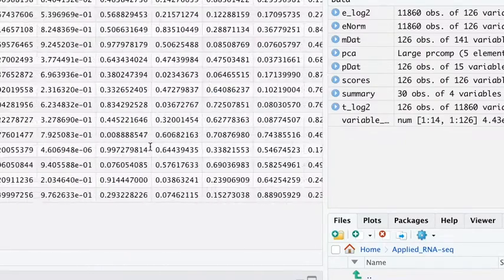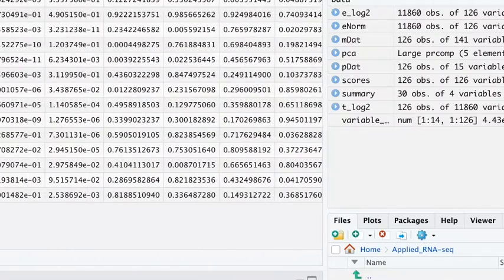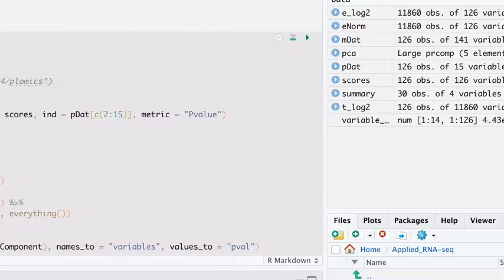Okay, so it's a long format data frame, but basically for each PC, we see how much that variable is contributing towards our entire data set. Now we're just going to manipulate the data a little bit so that it's easier for us to put it into a plot.